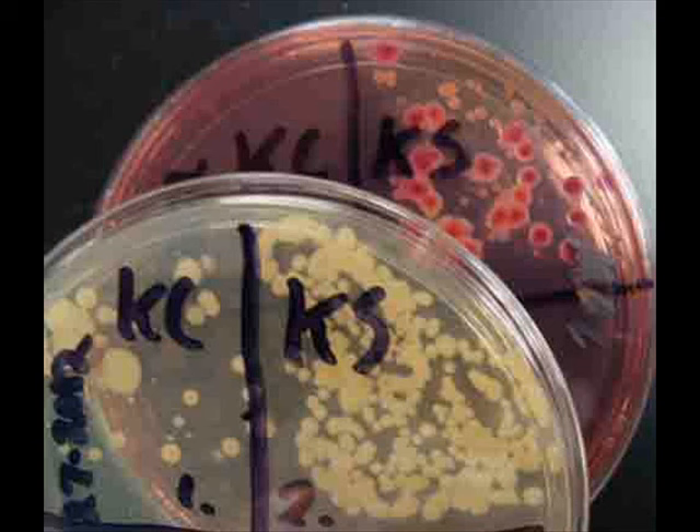MacConkey's is selective, so we see fewer colonies because only Gram-negatives will grow, and those colonies are lactose fermenters. Students also obtain samples from their bathroom counter and bathroom sink. Students are often surprised by the result because they expect to find more Gram-negative enteric lactose-fermenting bacteria in the bathroom than in the kitchen, but that's typically not the case. The kitchen has so many Gram-negatives because of the food we process there — meat in particular, but also vegetables and fruits.